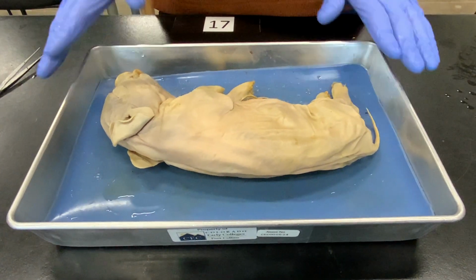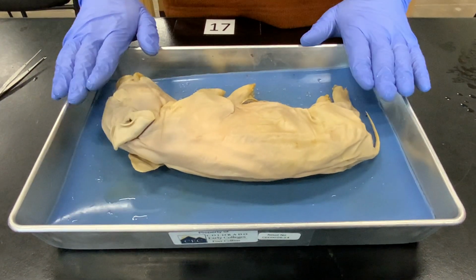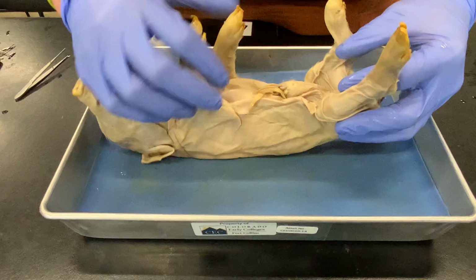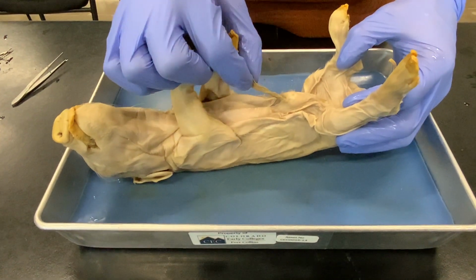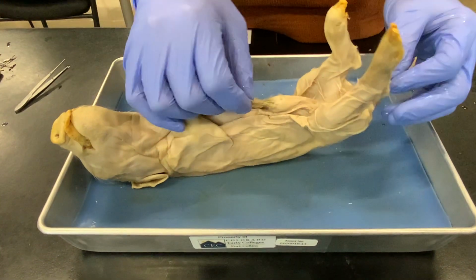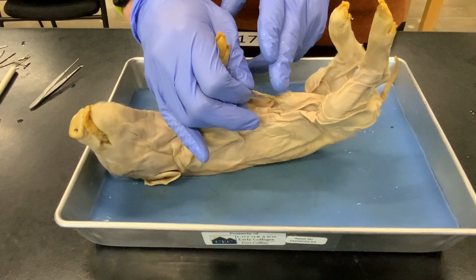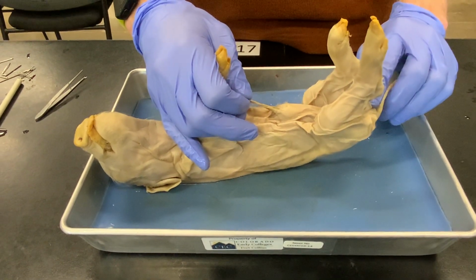One thing that's different about a pig is that even on a fetal pig like this, you can tell the biological gender from the external anatomy. And on a pig, what you look at is on the ventral side. There's an umbilical cord here where it was connected to the mother. On a male pig, the urogenital opening, so the common opening for excretory and reproductive tracts, is next to the umbilical cord, and on a female, it is just below the anus here.